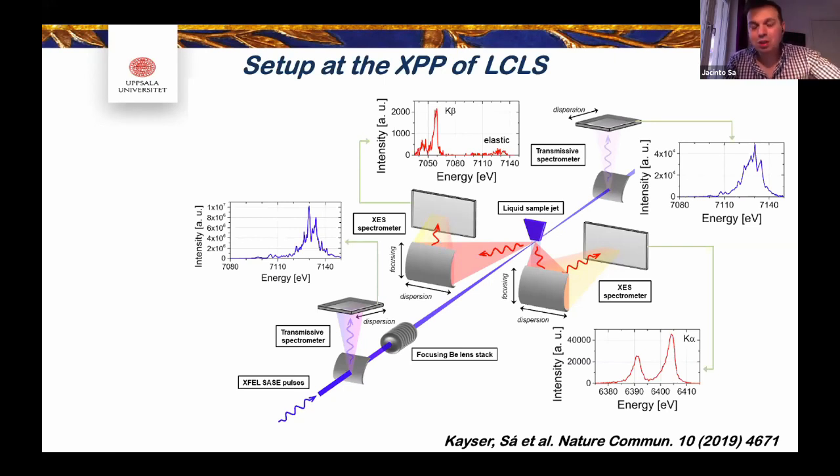So you have to be able to refresh the sample. And I would say at the LCLS, when we did these experiments, we were running at 100 Hertz. We also got the shortest pulses that they ever gave. That was the 5 femtosecond pulses. And the jet, the normal liquid jet, is okay to replenish the sample.